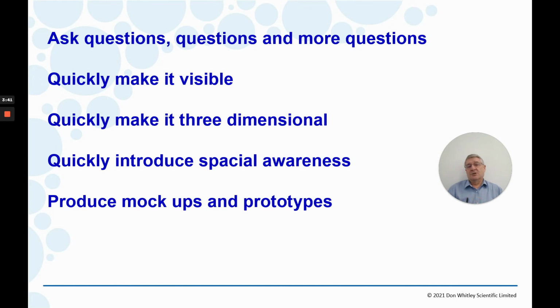We ask a lot of questions, and we quickly seek to make our understanding visible. We turn our understanding quickly into 3 dimensions, sometimes in software, sometimes in prototypes and mock-ups, as you've heard already. And we're trying to gain a sense of the spatial awareness and interdependence of instrumentation, tasks to be performed, labware, and so forth.